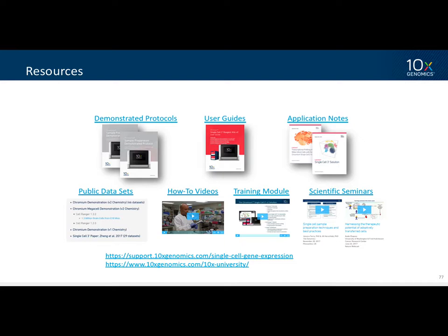If it's below 70%, you will get background. There might be instances where someone brings samples at 50%, and this is a super precious sample, and they say, we know we're going to have background, but I cannot get anything else, and I do want to see the results anyway. It's their call. They will get background. And there will be a bill associated with that, even if the data is not very good.